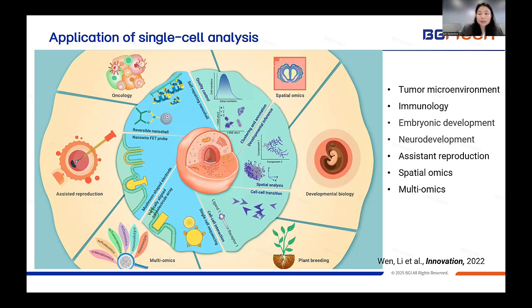Additionally, it plays a crucial role in spatial omics because it can be used to map gene expression across tissues and integrate multi-omics data for comprehensive biological analysis. So single-cell analysis offers a very powerful tool for advancing research and application across multiple research areas.